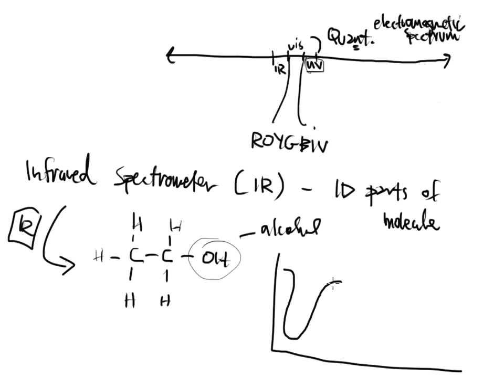If that OH group was not there, but another group was there instead, like bromine or chlorine, or maybe that OH group is a double bond O, or maybe it's a C double bond O. Who knows what it is? There's tons of different choices that are out there. They each have their own routine that they like to do, and they show up a different way on what we would call the spectrum. It helps us to identify what is on the molecule.